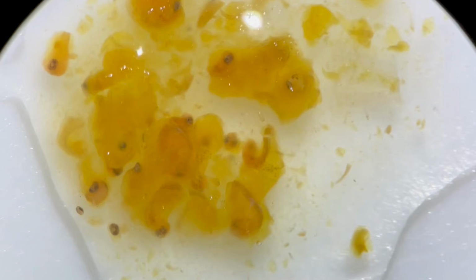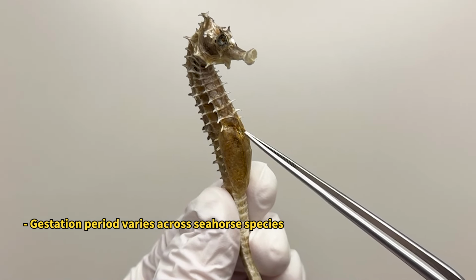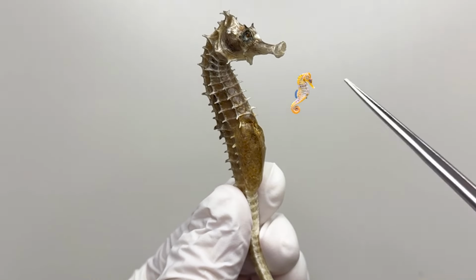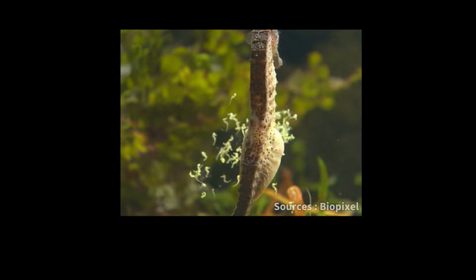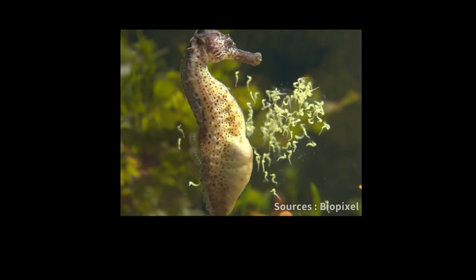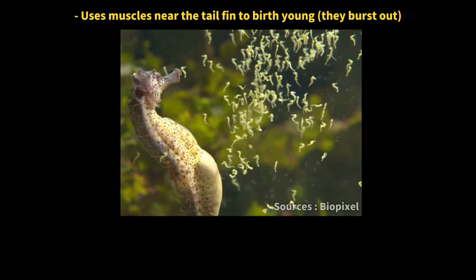It was dried, so it's not in the best shape. You can notice that its eyes and tail have somewhat developed. Male seahorses carry their young in a special pouch for more than 3 weeks. When the babies are ready, the male releases them into the water. Watching a seahorse give birth is really something. You can see the babies popping out of the pouch hole.